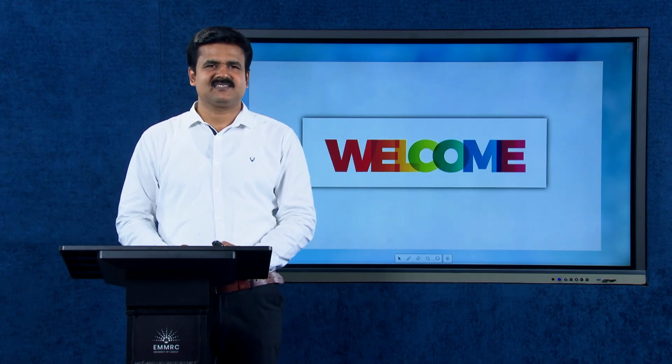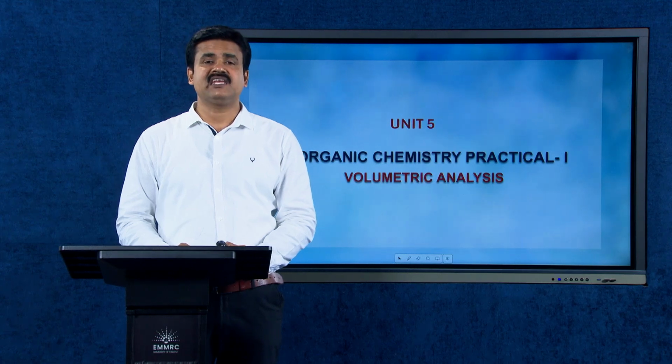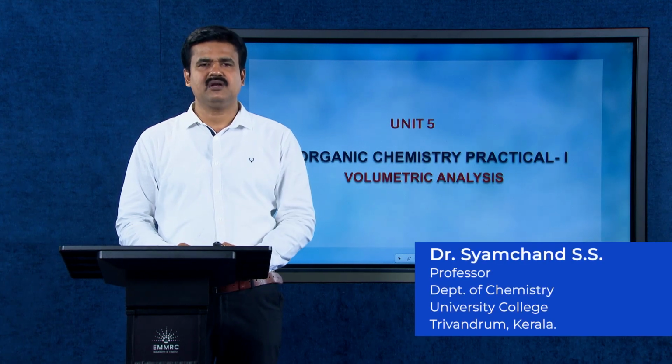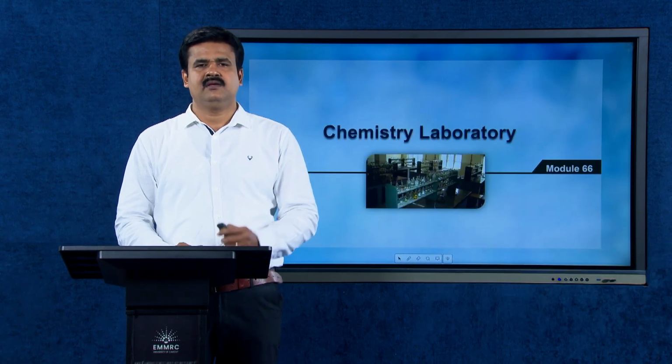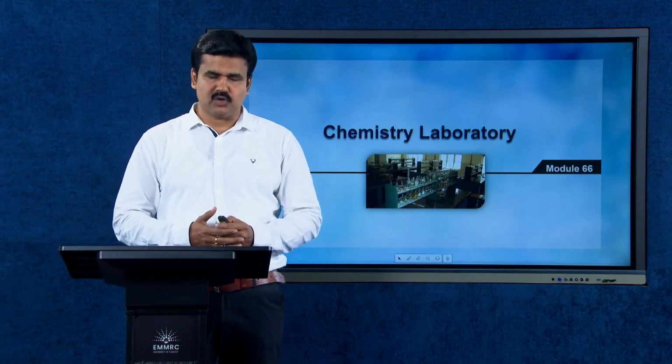Welcome dear learners. We are beginning a new unit, that is Unit 5, Inorganic Chemistry Practicals 1. Here in this module, we are giving emphasis to volumetric analysis. In the present module, we are focusing on the chemistry laboratory.